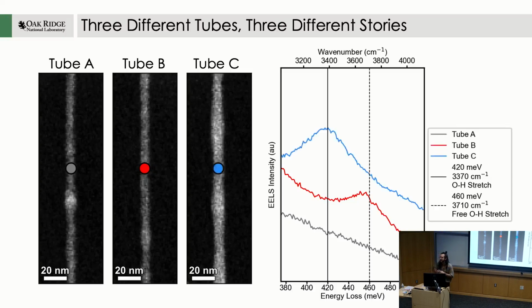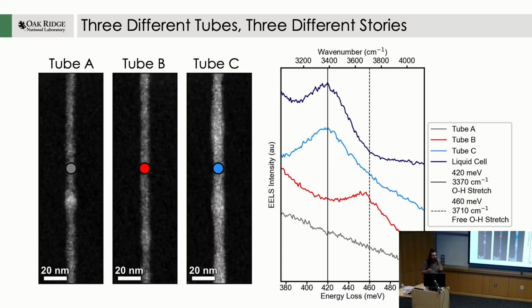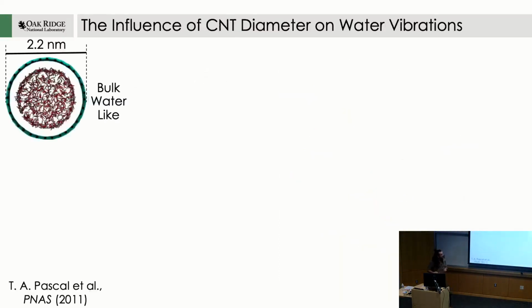Then we can put it on yet another sample, and shockingly, now we're suddenly seeing this 420 millielectron volt peak. And just comparing to the bulk water measurement, it sure looks a lot like pure bulk water in terms of both the frequency and the line width of the vibrational excitation. So what's going on? Why do we have these disparate responses, especially between these two? This one just looks like it's empty, so we don't need to think too much more about that. But why do we have such a different response between these two?